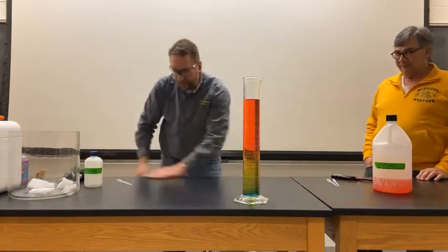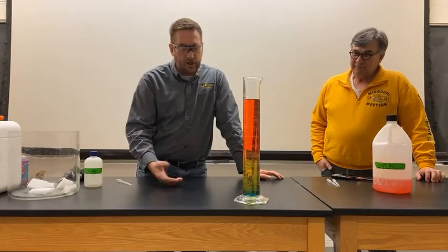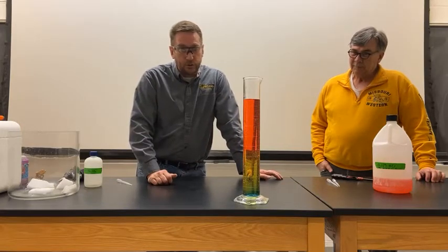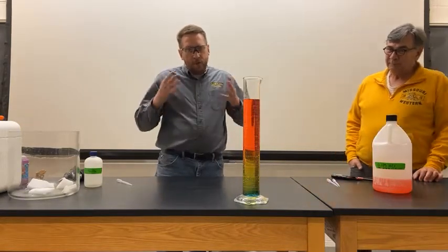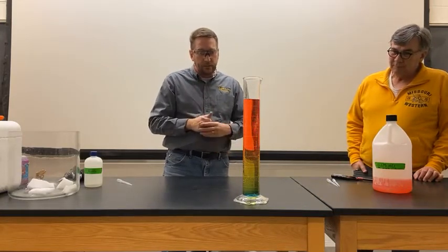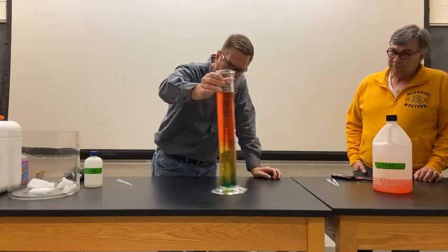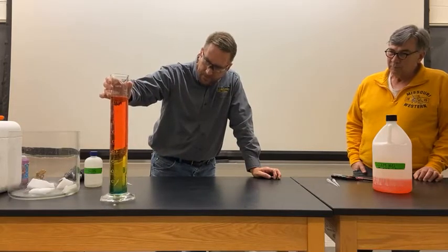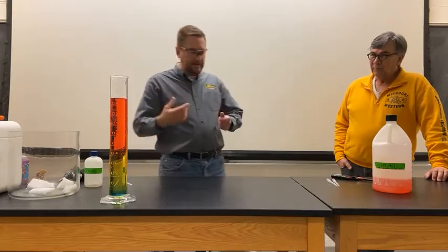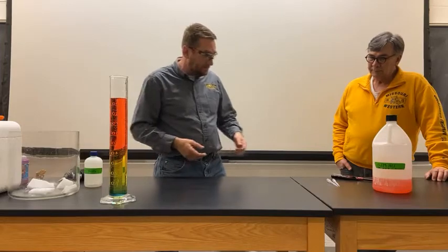So the point of this is that sodium carbonate changes the pH of our solution, and carbon dioxide, when it dissolves in water, can do the same thing. And so we're going to look at that here in our next demonstration. So I'll leave this over here, and we'll watch it. It may mix a little bit because you can see we're generating some bubbles as the hydrochloric acid mixes with the sodium carbonate to generate carbon dioxide.